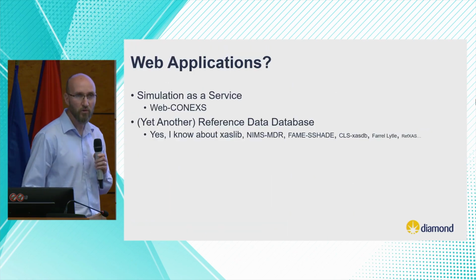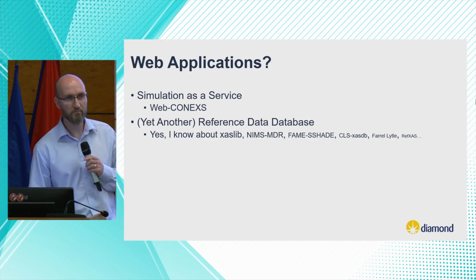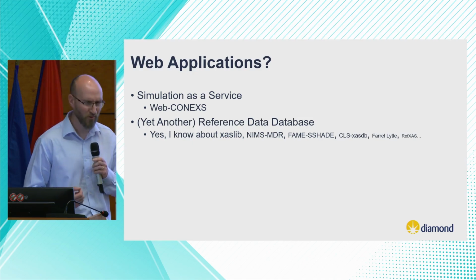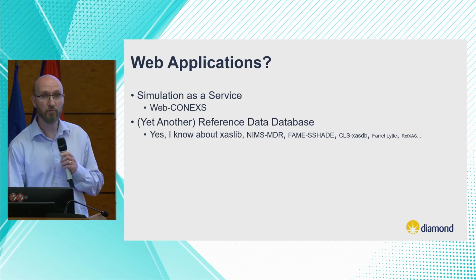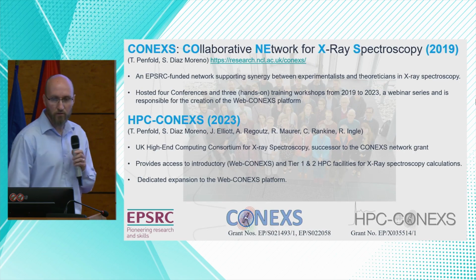So what needs do our spectroscopists have for web applications? Well, there's two main features: simulation as a service, and, it's really important, I think, that every spectroscopist has their own reference database of standards. So they really want their own reference database of standards.